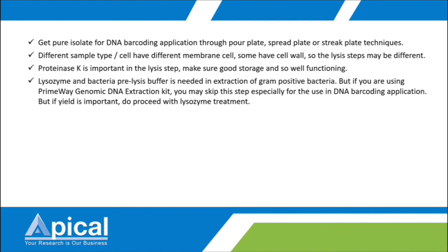However, if you do not have lysozyme, you can skip this step when you're using our Primeway kit, because we actually tested it. We have the data. The DNA amount, even if you skip this step, should be sufficient for DNA barcoding application.